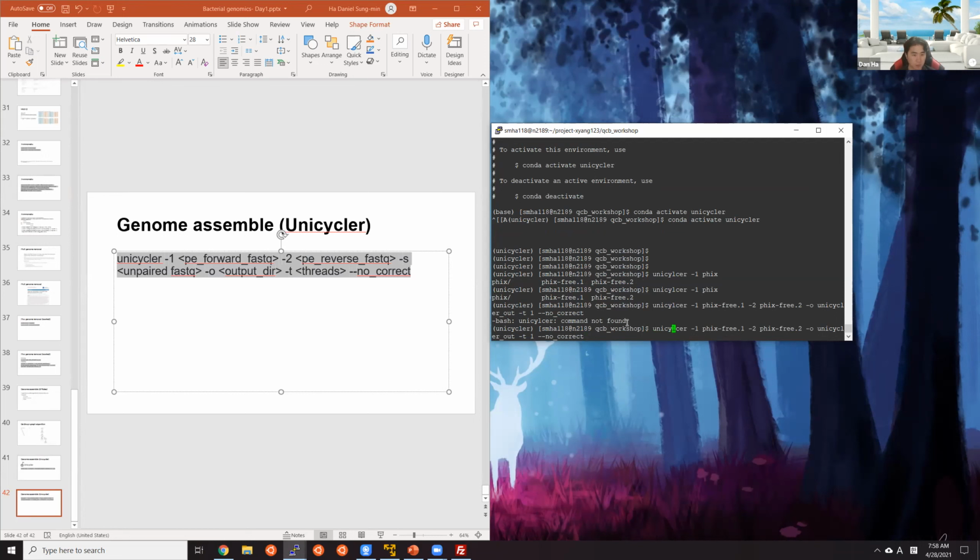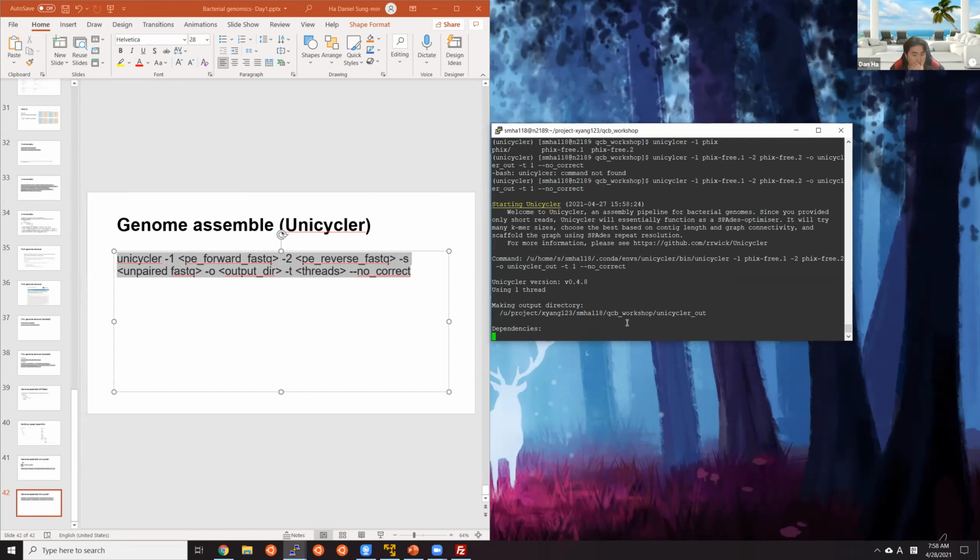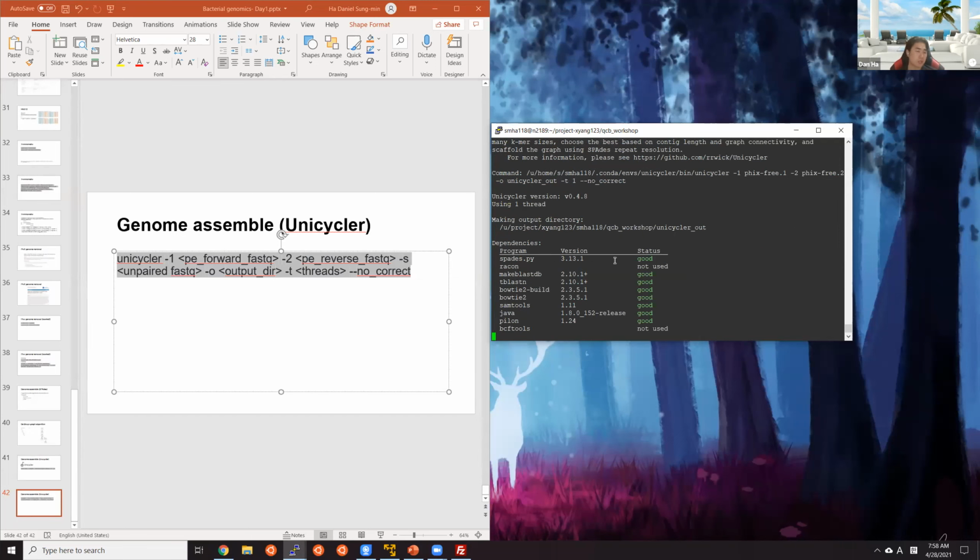Oh, there's a typo. And it's going to start running. It's going to take about an hour or two to finish the assembly.